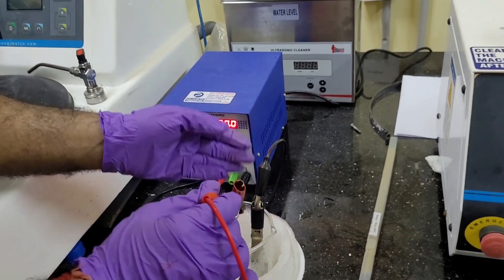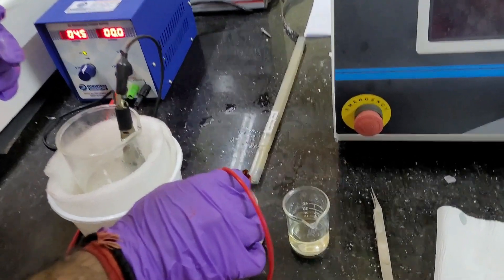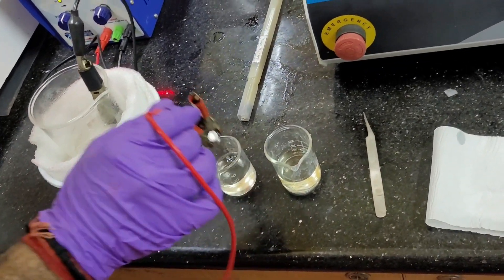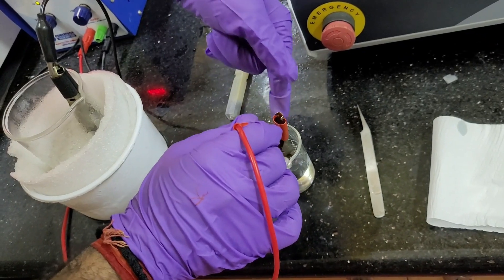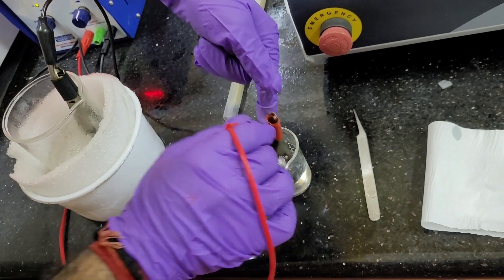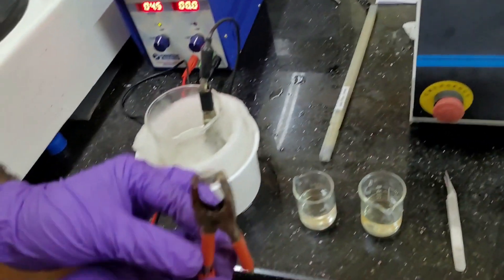Thank you very much. Now, after doing this electropolishing, immediately we have to wash this sample into the first beaker. And then, for more cleaning, we have to use the second beaker where same ethanol is there. So, in this way, we can do.